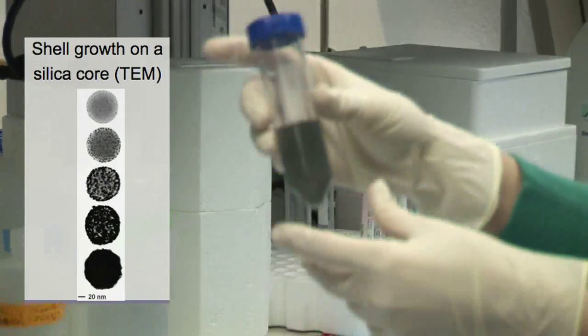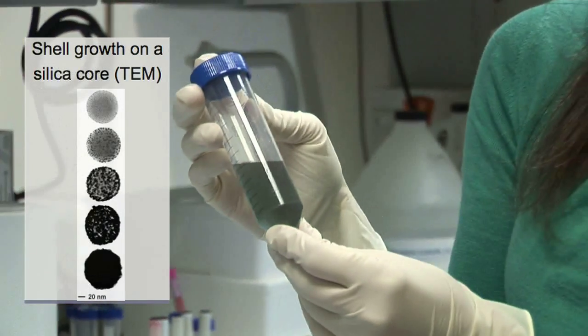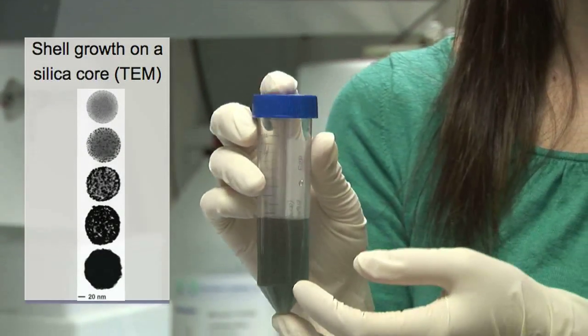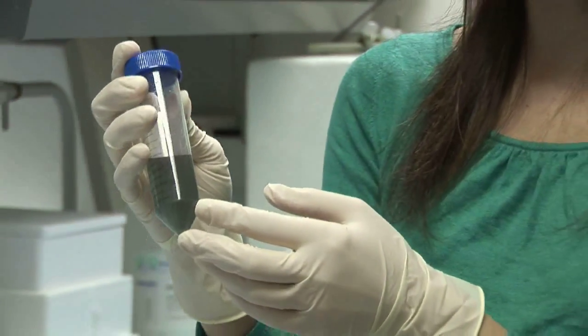That results in the final nanoshell product, which is a nice teal green color. This is the product that we would actually mix with the cancer and expose to light — it would absorb the light and convert it to heat.